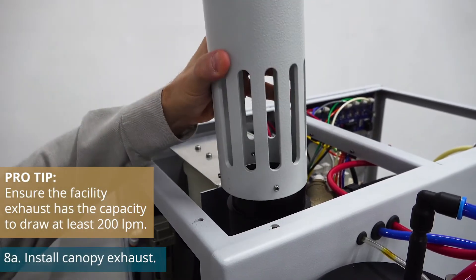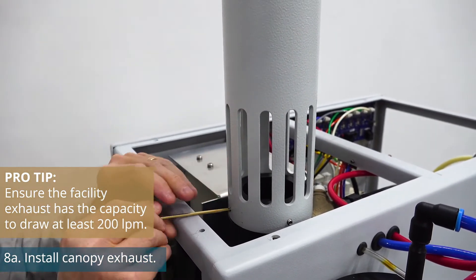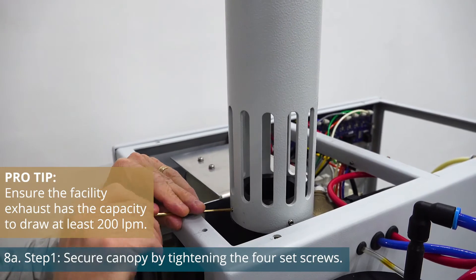Next, install the canopy exhaust to the top of the unit following the instructions of the manual. Canopy exhaust is only needed if you did not purchase the local exhaust.